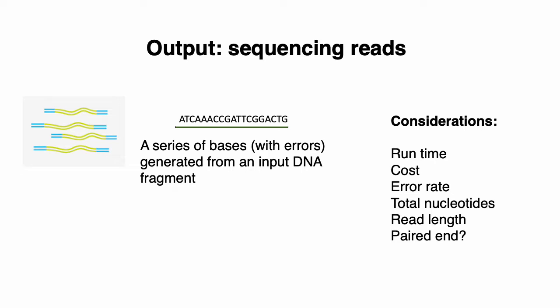Why this matters is that, at least in terms of genome assembly, as we'll see later on in this lecture, because sequencing technologies can only sequence fragments of the original genome, you have to do additional work to piece together your short sequences back into the original genome sequence. That process is generally much easier when you're using longer read technologies compared with shorter read.